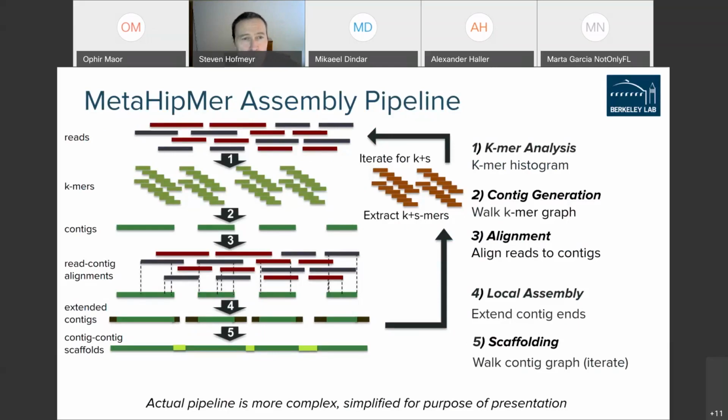And you have multiple layers of these reads, and that's the sequencing depth I talked about before. Each part of the final genome can potentially be covered by multiple reads, so you have to combine those multiple reads.